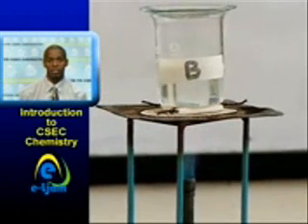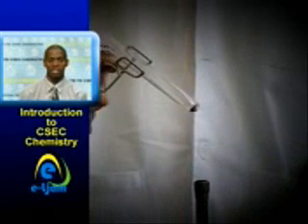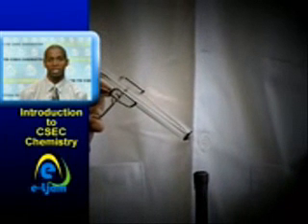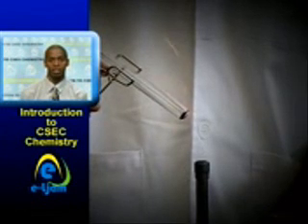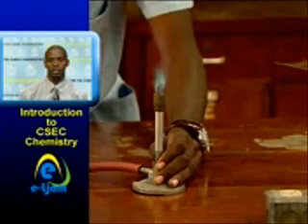The Bunsen burner is used in laboratories to provide an open flame primarily to heat substances. In order to use it safely, it is important to know the correct procedure for lighting and adjusting the Bunsen burner. Bunsen burners can produce 3 different types of flames.